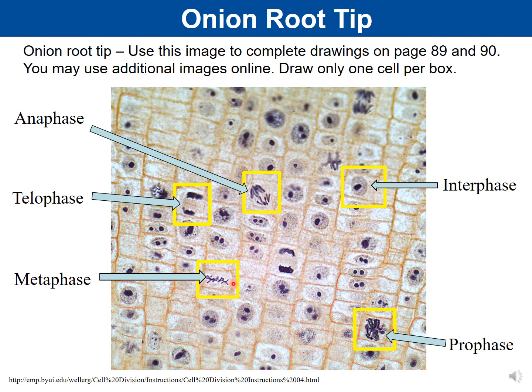Notice my middle is stuck together, but my arms and legs don't have to be stuck together. They can go off to the side. That's what you're seeing here. So you're seeing that the centromere is lined up in the middle, but the arms and the legs can go off to the side. What you're looking at in this picture, the purple again, those are the chromosomes. We have our cell wall and cell membrane. You can't distinguish between them. And then we have the cytoplasm, which is the space in here.